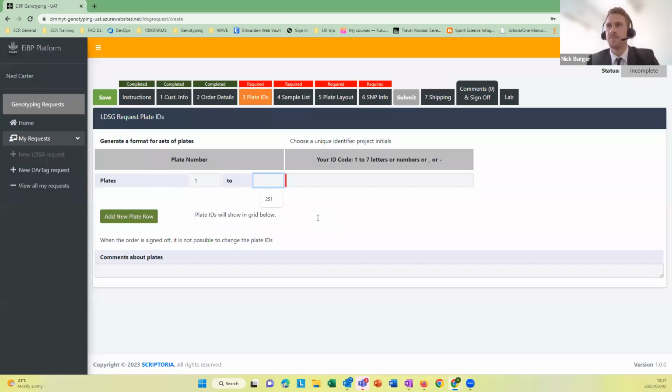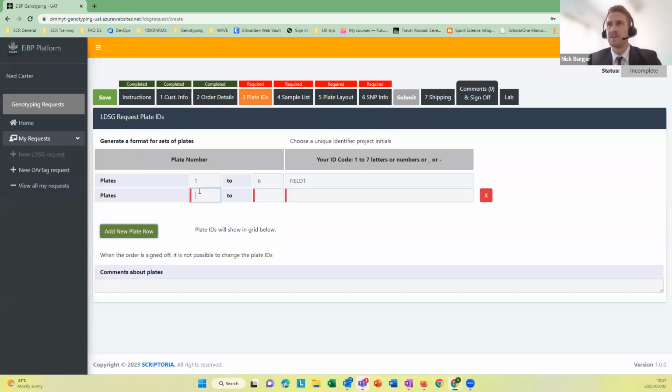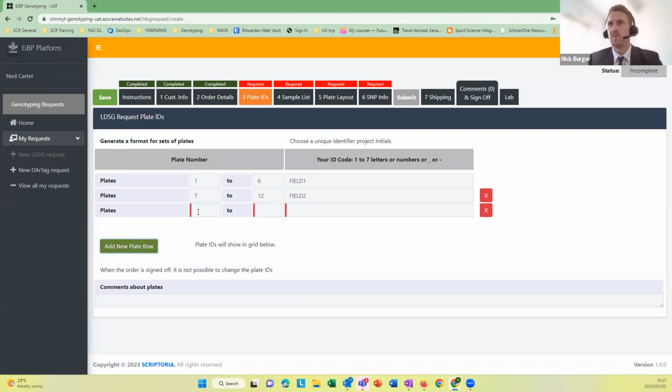Thanks, Jim. So, for instance, here I'm going to select plates 1 to 6 for field 1 in this instance. I can then select a separate set of plates, so let's say from 7 to 12, and this will be for field number 2. And let's do one more, 13 to, let's say, 20, and this will be for field 3.